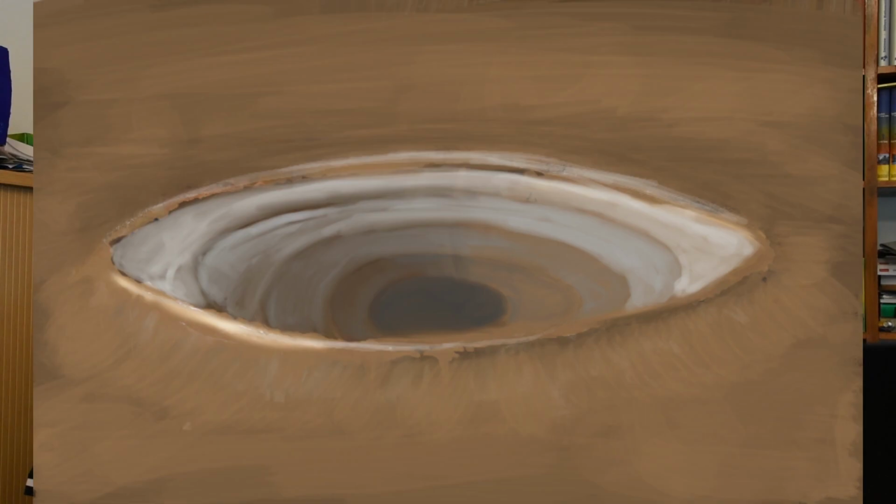So hello Felix. Hey guys, like Julius just said, today we are going to explain more about Calotte, but before we do that, we are doing again a little review of the first Calotte video we made. Last video we talked about the different measurements that we took at the different points within the Calotte crater to get the material data of a multi-layered material.